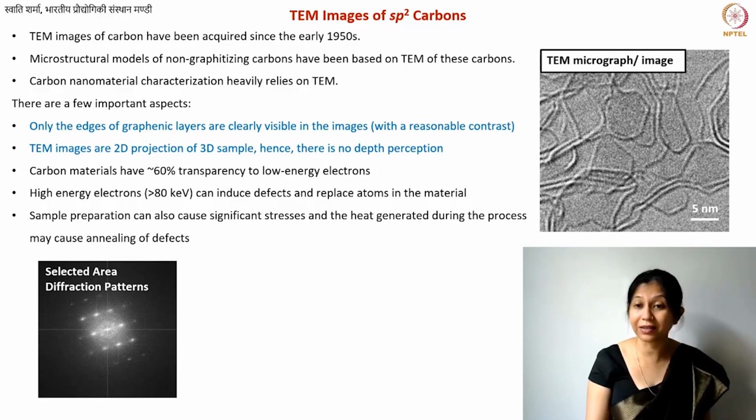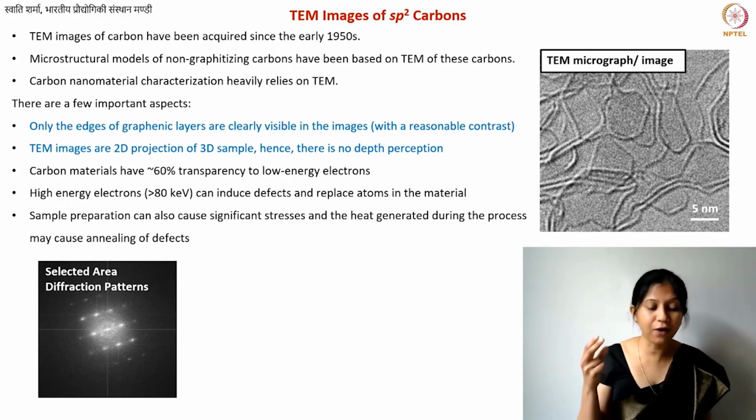You have a hexagonal structure but not close packing, and all of these rules which allow you to find the potential crystal structure are for well-defined crystal structures. They are for HCP in this particular case, and our material is not HCP. So don't get too confused by the diffraction patterns. That is what I'm trying to say.